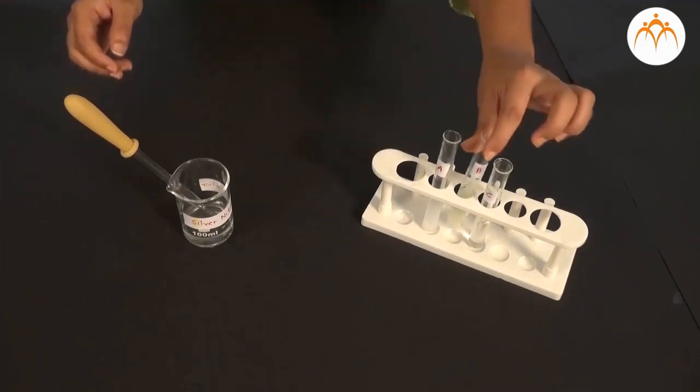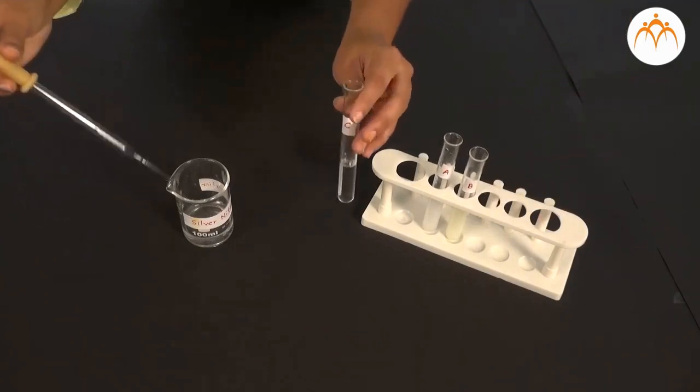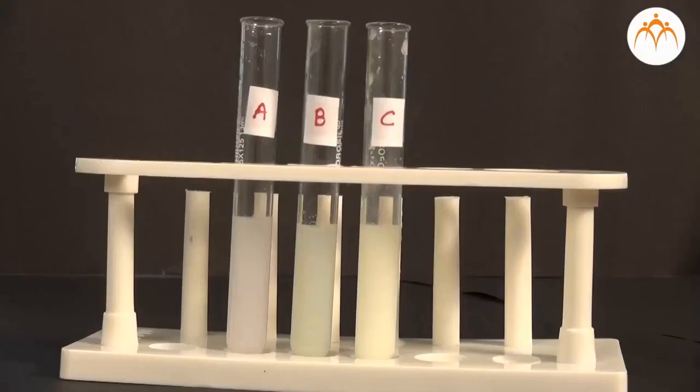This indicates that there is a possibility that there may be halides or compounds of halogen in these 3 solutions. These halides are giving us precipitates. In test tube A, the precipitate formed is white in color. In test tube B, the precipitate formed is light yellow in color. In test tube C, the precipitate formed is dark yellow in color.